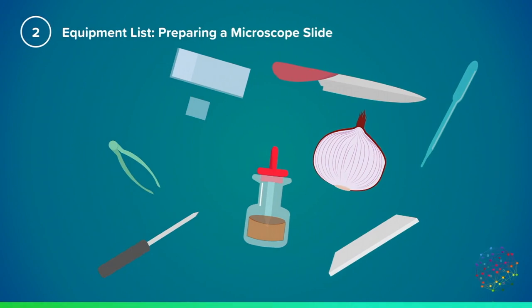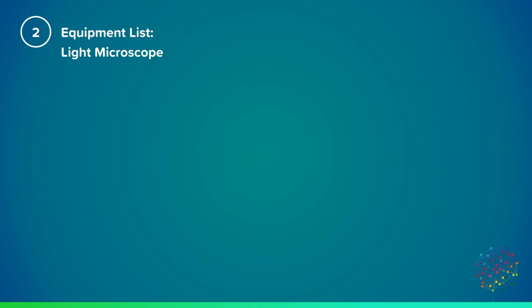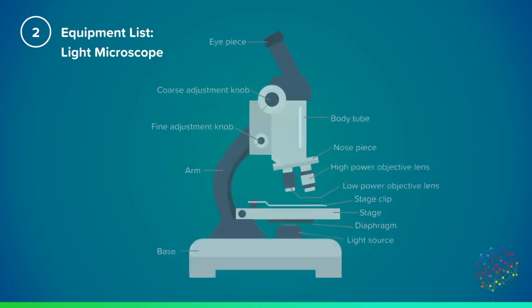The equipment you'll need to prepare a microscope slide is the microscope slide itself, and a cover slip, a knife, a pipette, onion, white tile, iodine solution, mounted needle and forceps or tweezers. You'll also need a light microscope to view your cells.